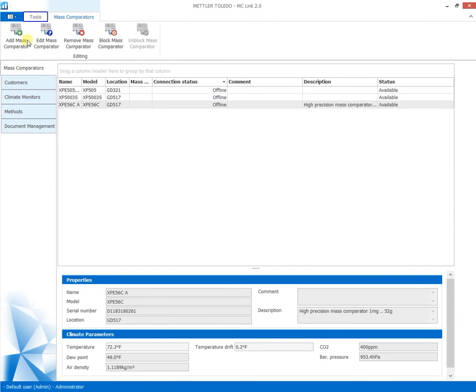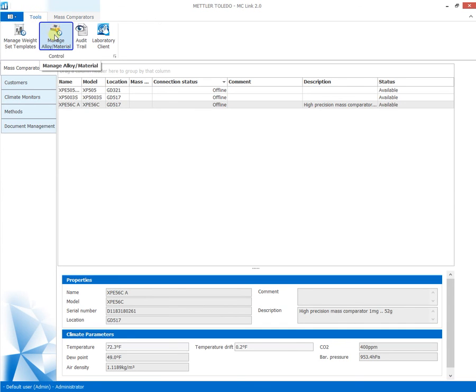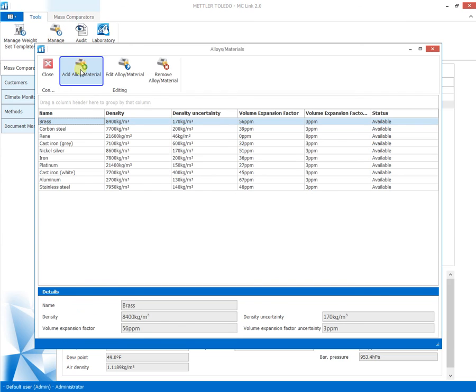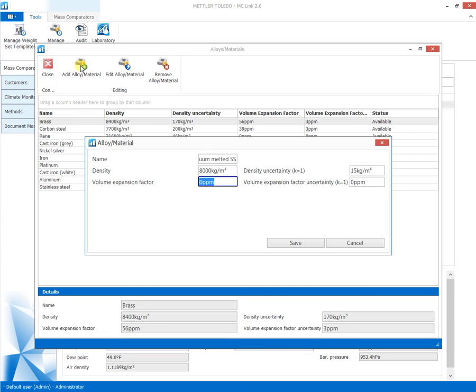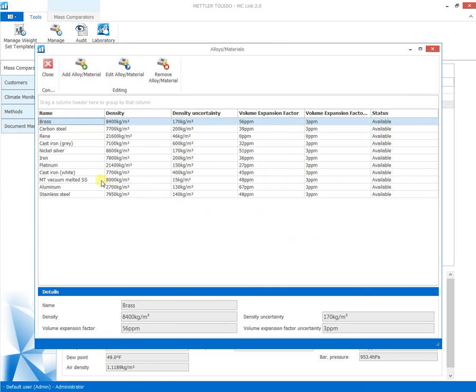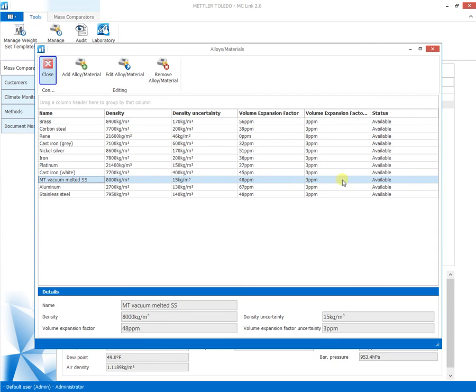To generate weight materials, select Tools and Manage Materials. By entering the required parameters, including the corresponding density and expansion coefficients, the material is specified with all parameters and ready for selection for later generation of weight set templates.